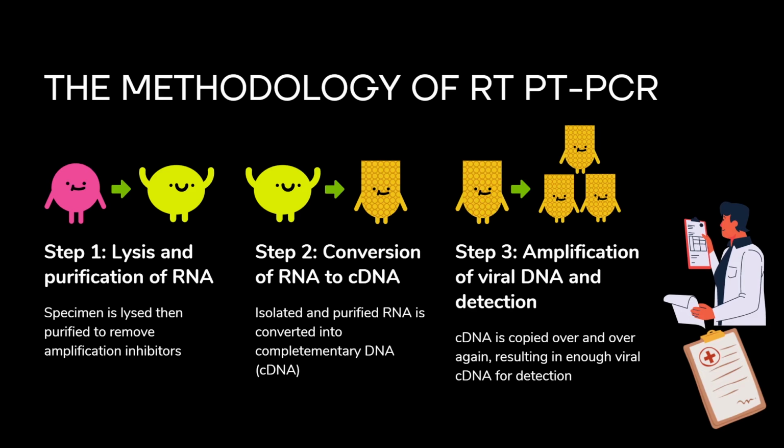This is detected through the presence of fluorescent signals in which fluorescence reporter molecules increase in fluorescence as the reaction proceeds following the accumulation of the amplified viral products.